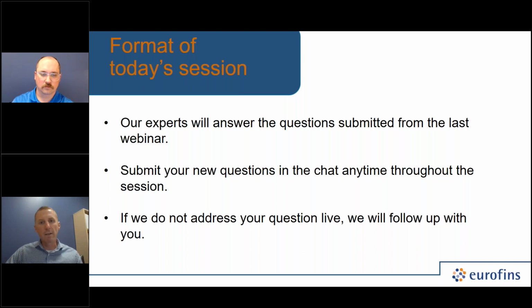So first, we thought it would be a good idea to start with a little bit of a refresh regarding flow cytometry as a technology, specifically for probiotic enumeration. So Anjay, could you give us just a little bit of a refresh on how flow cytometry is used to enumerate probiotics and what the technology is?